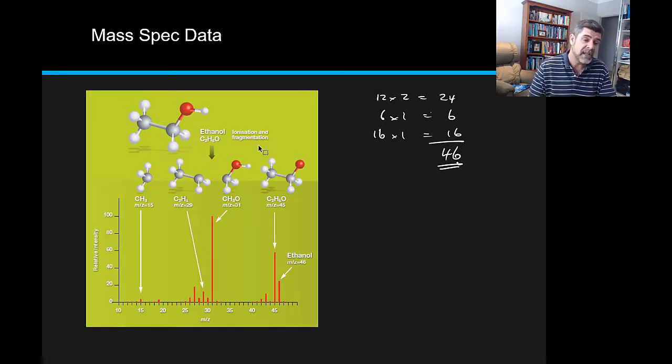Now you can, interestingly enough, see a peak at 45. Now 45 has only lost a mass of one and a mass of one is a hydrogen. So you can see the first of the little molecules that we have on the side here is a molecule that is basically ethanol without that hydrogen attached to the oxygen. So 46 minus 1 is 45, so that means it must have lost a hydrogen that fragmented off it.